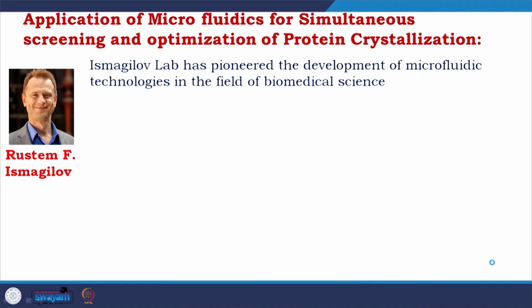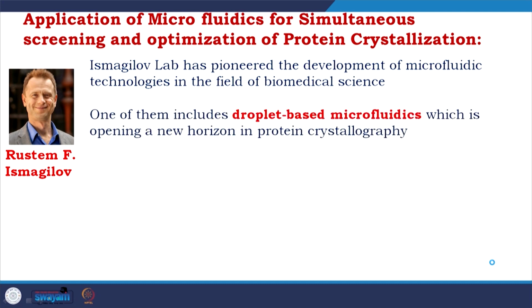So, we went to his lab and I had the opportunity to look at the setup. The Ismagilov lab has pioneered the development of microfluidic technology in the field of biomedical science. One of them includes droplet-based microfluidics, which I am going to introduce to you, and which is opening a new horizon in protein crystallography.